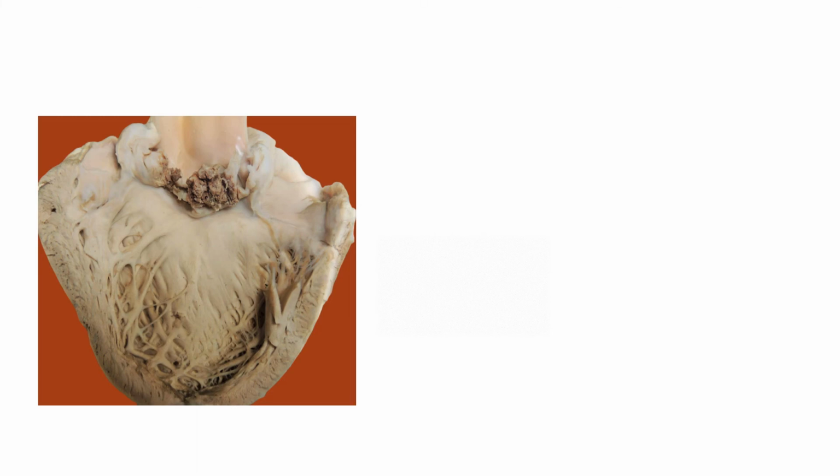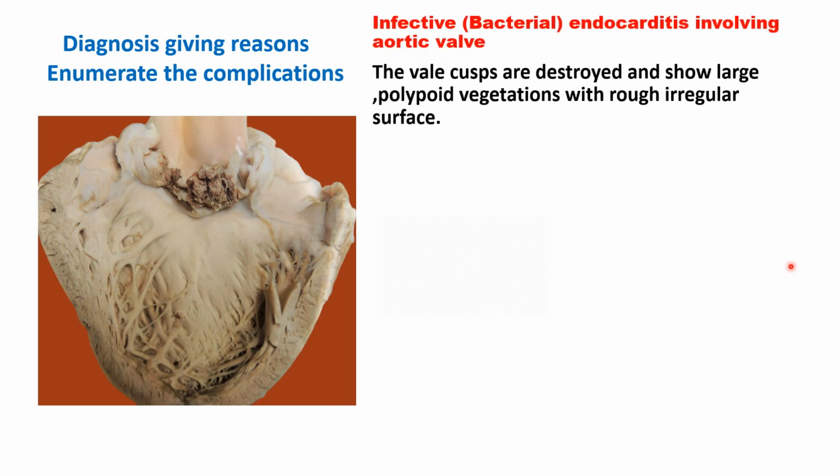Yes, this is the specimen of the heart seen from the left ventricle. This is the aorta, and this is almost normal appearing or slightly dilated wall of the left ventricle compared to the previous specimens. Now this is a case of endocarditis.